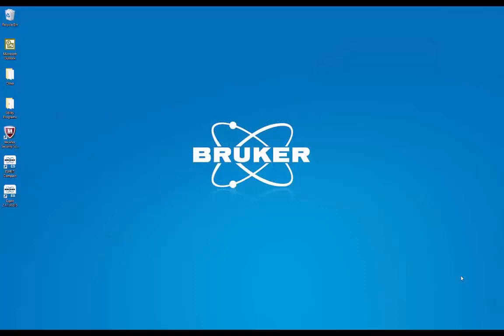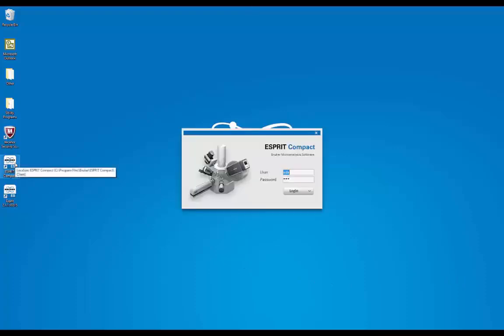This is a presentation of the ESPRI Compact Software. To start the software, we work from an icon on the desktop, double-click, brings in the login environment.